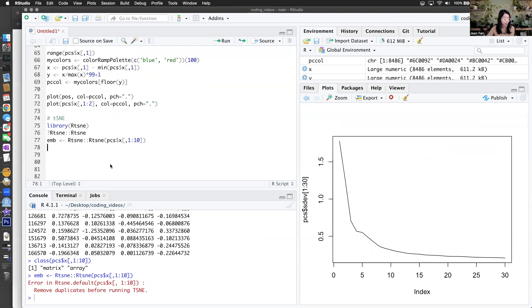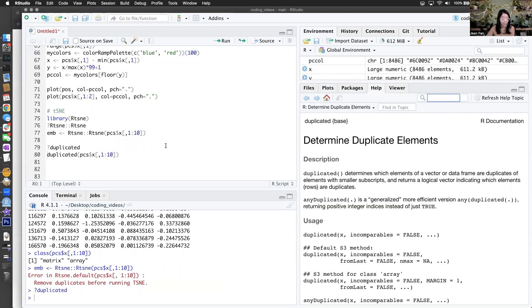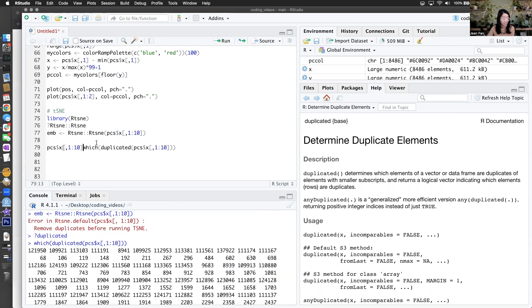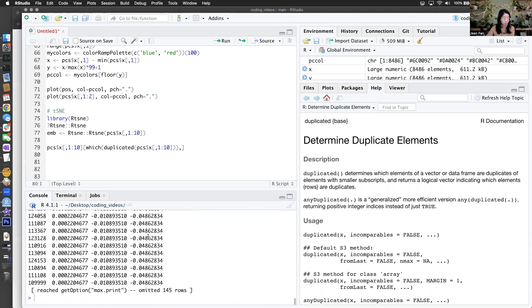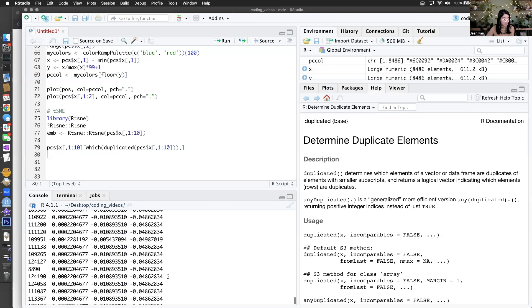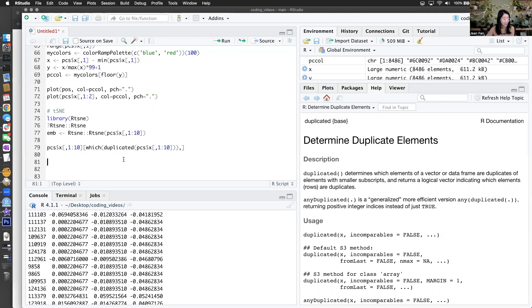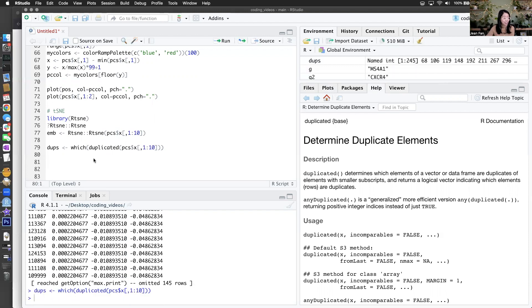Okay, let's see. It says to remove duplicates before running t-SNE. Why are there duplicates? We can use the duplicated function in base R to figure out which rows are duplicated. There are a lot of duplicates. Let's double check that they're actually duplicated — yes, they are indeed duplicates. They are indeed duplicates, so we'll just have to figure out why they're duplicates. It's a little suspicious.